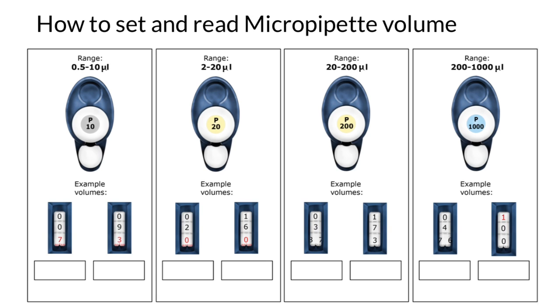And you don't have to memorize which micropipette works with what range. It's actually also shown on each micropipette. But of course, while you're working with these micropipettes, there are not too many of them, so you can also just memorize this range of volumes.